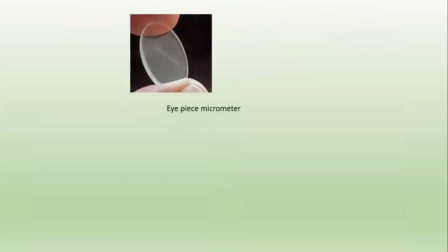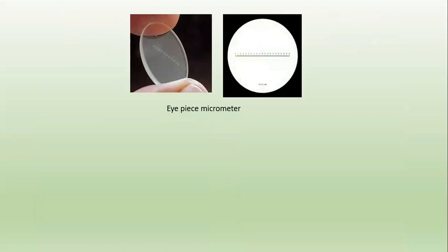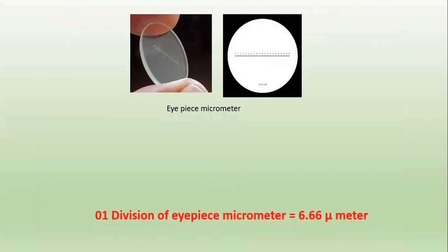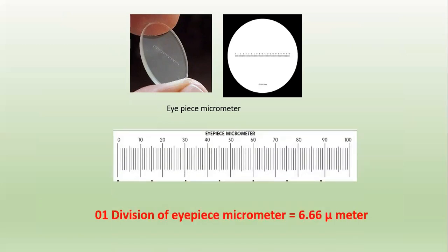Friends, this is your eyepiece micrometer, and here the scale is there, which is to be calibrated by utilizing a stage micrometer. After the calibration, we see that one division of the eyepiece micrometer is equal to 6.66 micrometers. This is your eyepiece micrometer scale. So let's see how to measure the length and diameter of the microscopical particles.